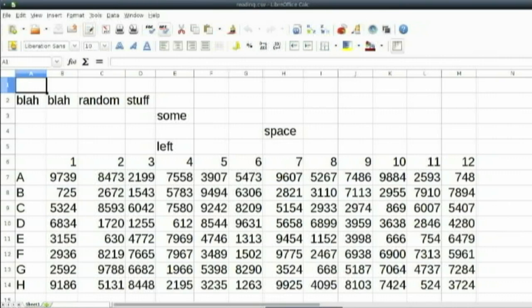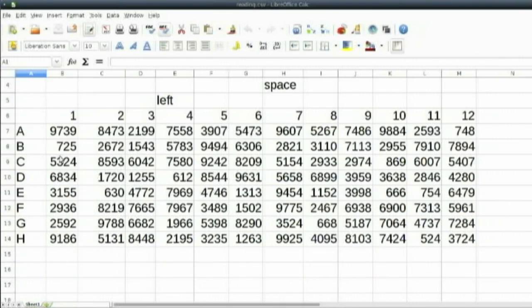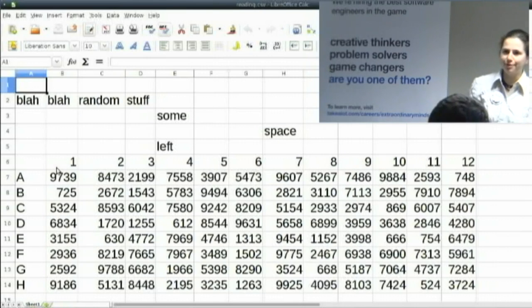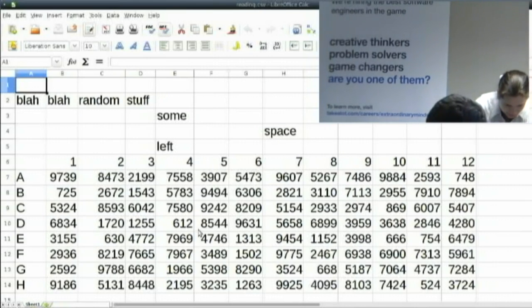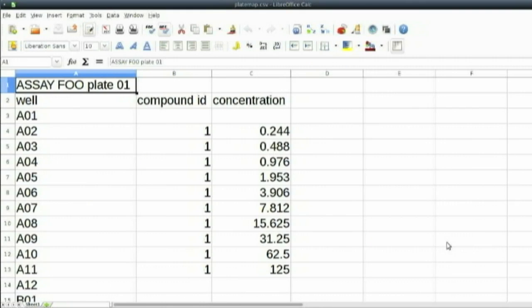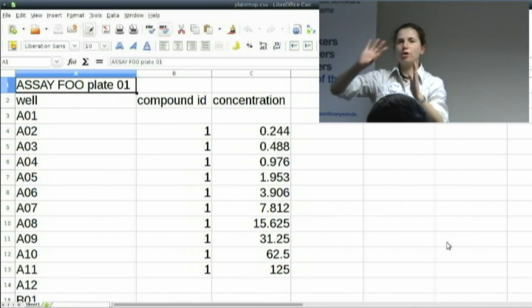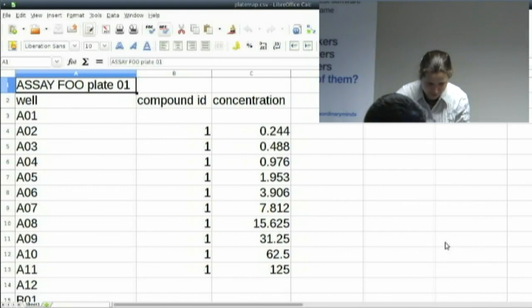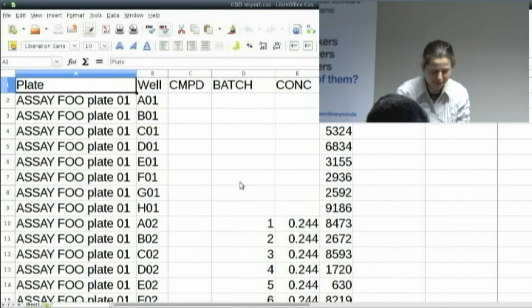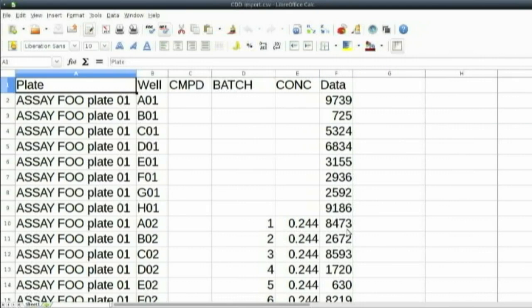I'll show you what the files look like because at the moment this is a bit abstract. The readings look something like a grid of numbers — the real data has a header on top telling you things about the plate reader, essentially eight rows by 12 columns. The metadata is something the researcher creates: for each plate there's a well with the ID of the compound and concentration, with columns repeated across the file for multiple plates. The CDD import format looks quite different: you have the plate name, the well, the compound ID, the concentration, and the data — all together in one row.